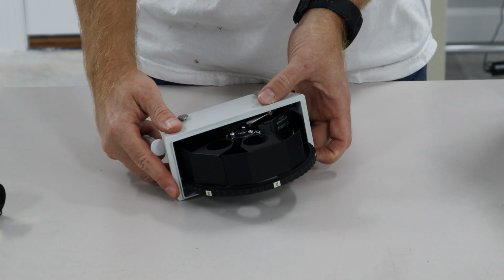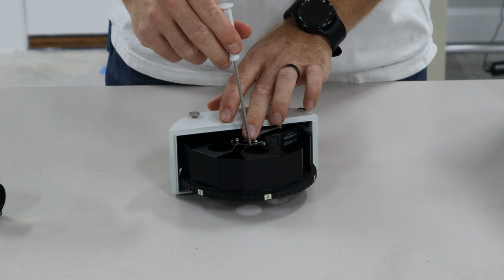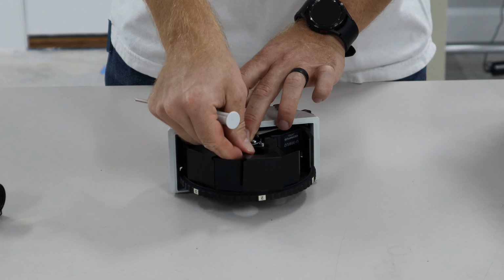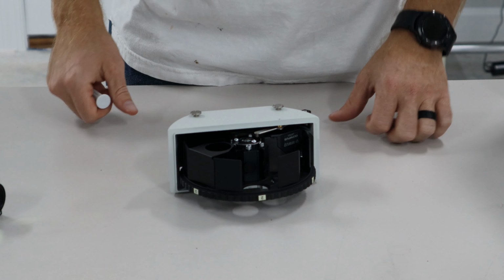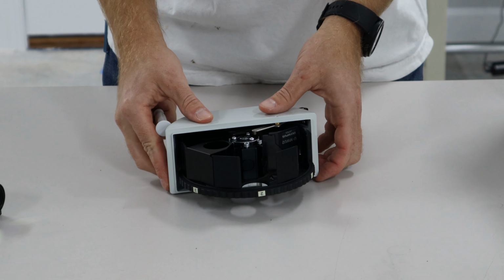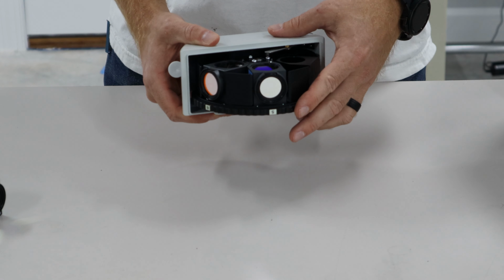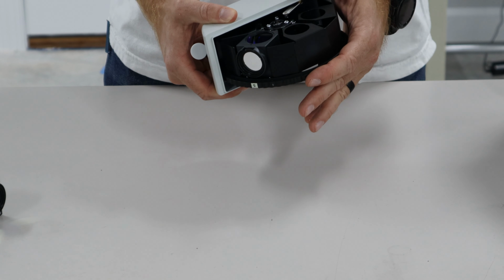Sometimes you'll see these filter holders. These are just placeholders that are sent from the manufacturer. We can take those out if they're in the way. Just same procedure, just loosen the screw, and then they've got a little notch, they pull straight out. All right, so now that we have the cube uninstalled and reinstalled, make sure everything turns really nice, and we'll go ahead and reassemble it.